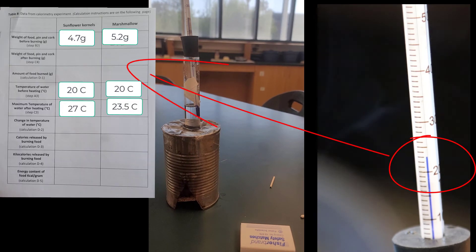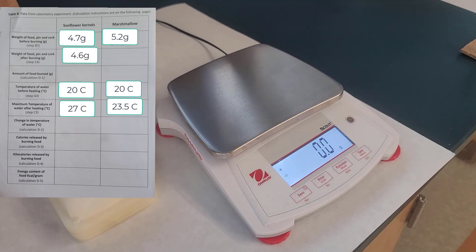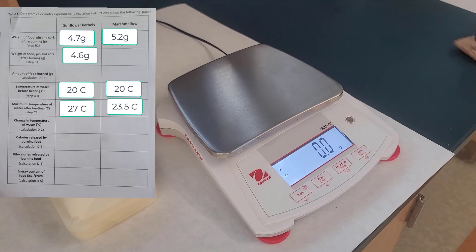Then what you're going to do is, once again after it's all cooled off, take the can off, go take your marshmallow, and weigh it. That difference represents how much you burned of that marshmallow.